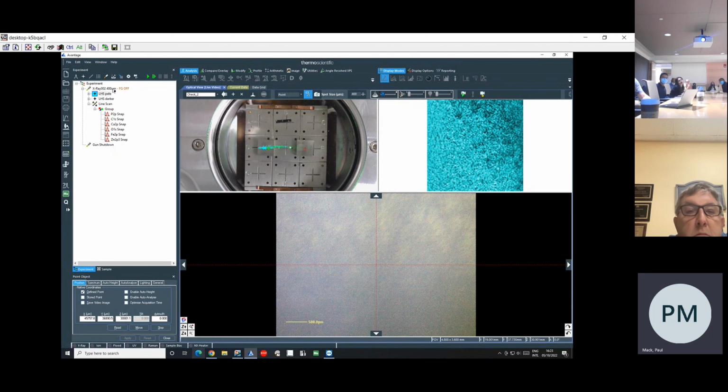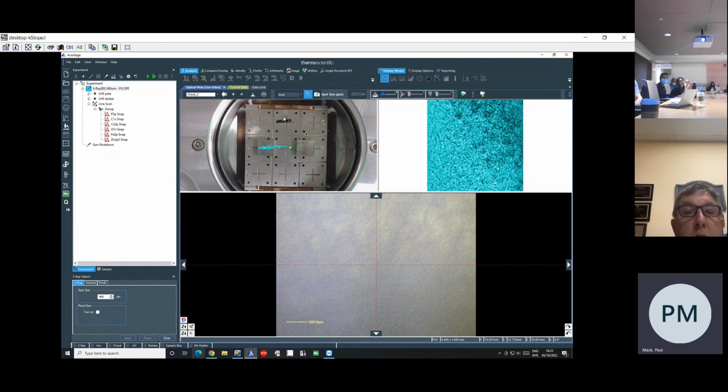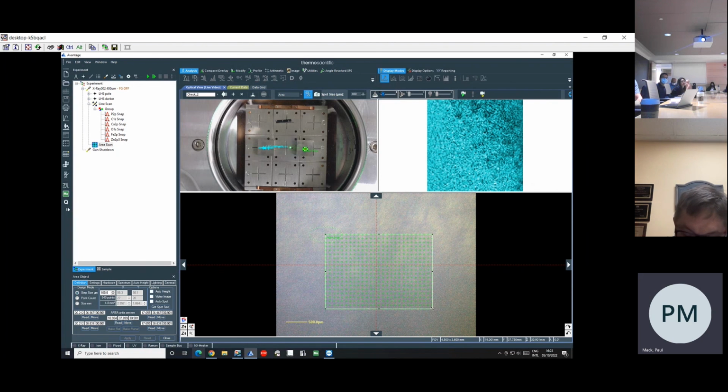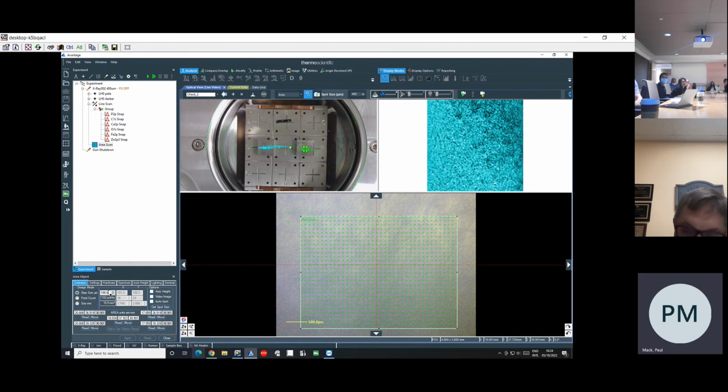Okay, so to create a map, normally you have your X-ray and then you have a point. If on the right-hand side, or in the middle rather, you select area, and then press the shift button, like in PowerPoint, shift and then just mouse drag, you can draw an area directly onto the optical image, which you can then resize, for example, or change the number of steps in it.